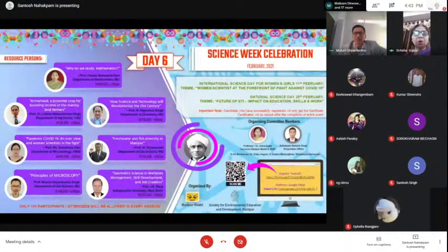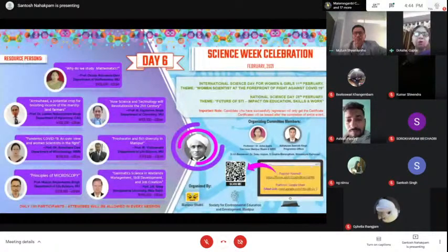You also talked about how the new advances compare over light microscopy, and you pointed out the differences. You began with the definition of a microscope, that it is an optical instrument which produces a highly magnified image and uses a lens or combination of lenses. You have talked about new advances of scanning probe microscopy.